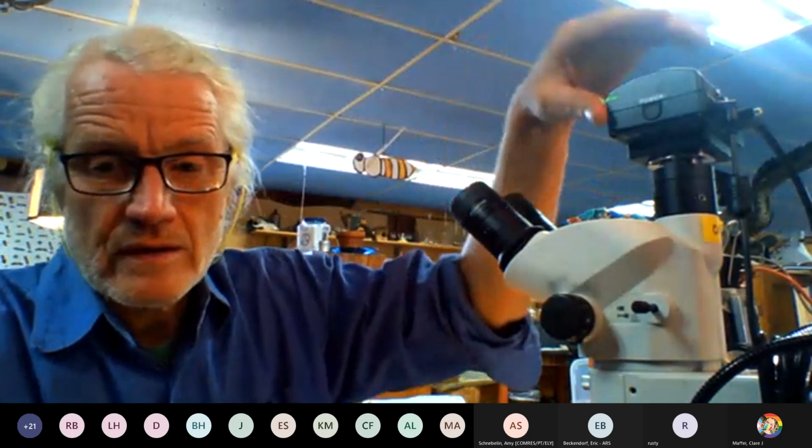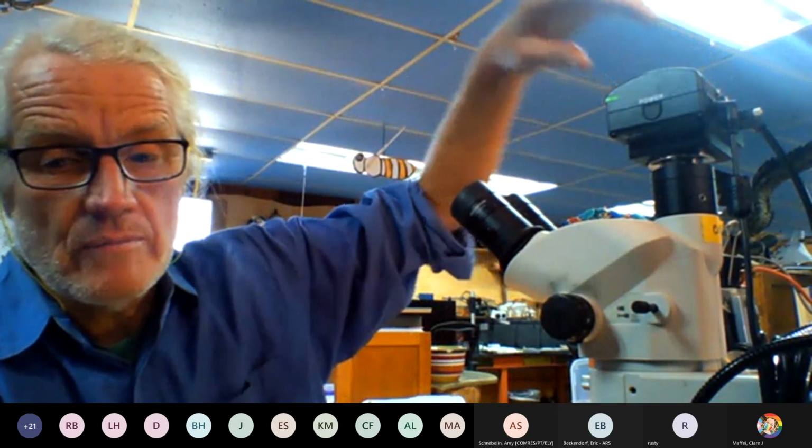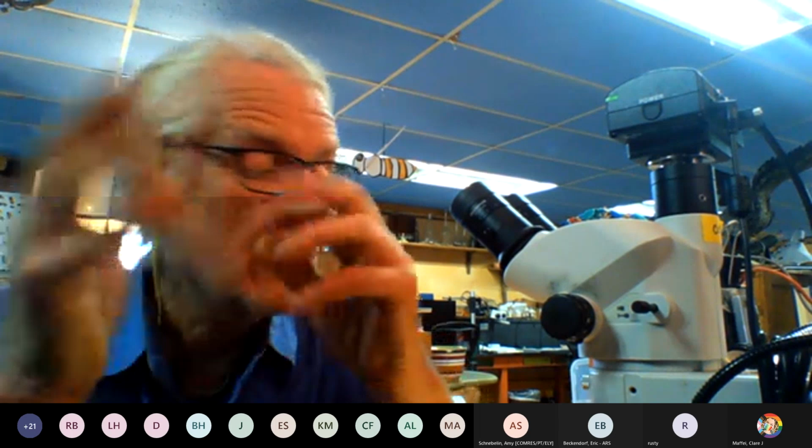This is the microscope. This is the widget, which is a Nikon widget with some relatively expensive software associated with it, which does all kinds of crazy things, like has measurement tools and has a person that helps set it up and is on call that we had to use at the beginning because it was pretty complicated. And yeah, it is porting live to my laptop and then out through the internet. Does that answer the question?